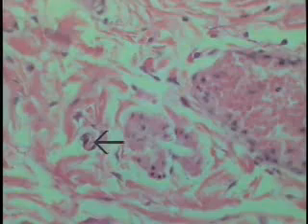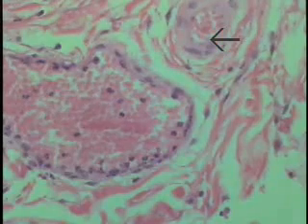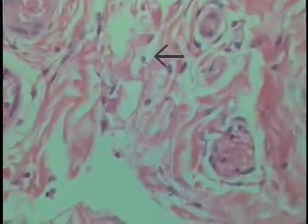That same field is seen at a lesser magnification, illustrating the capillary at this particular point, a small vein shown here, as compared to the wall and overall diameter of a small artery, an arteriole. Another capillary, a very large capillary perhaps, is shown here, and then the caliber of a venule showing here. So you can have some idea of comparison with these particular structures.